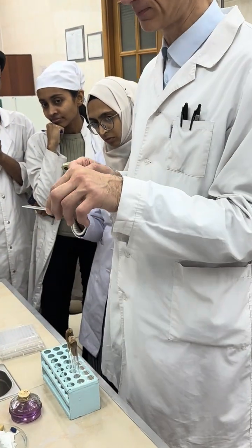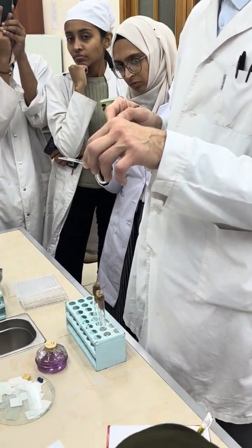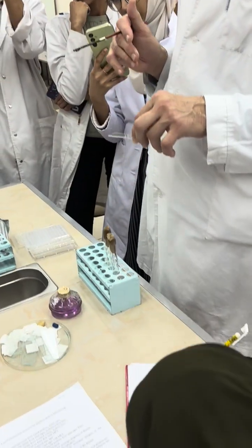So people put it inside, and here is the principal moment. Draw the oval and spread throughout the whole area of the oval, not dropped somewhere. A little bit, two or three movements, left, right, and that's all. It will be a very dense slide, limited in space, so the broader, the better the result.